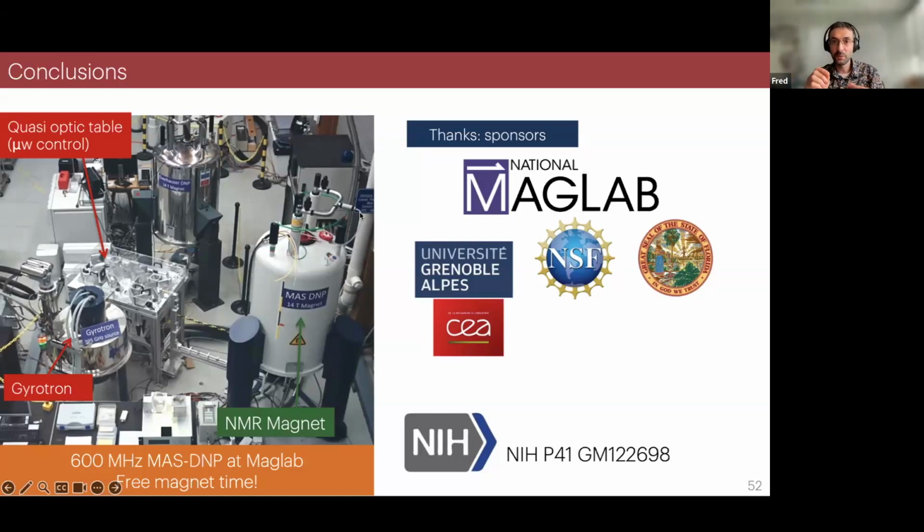You mentioned that it's possible to pass the limit of 658. Yes, it is possible. There's a paper, the one by Eric Boulot, where when you do helium spinning, what happens is as you cool down, the off signal can go very low because of depolarization. And when you do the ratio between the on signal and the off signal, this can go beyond 658.